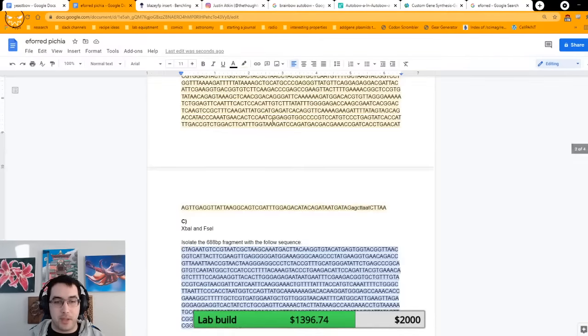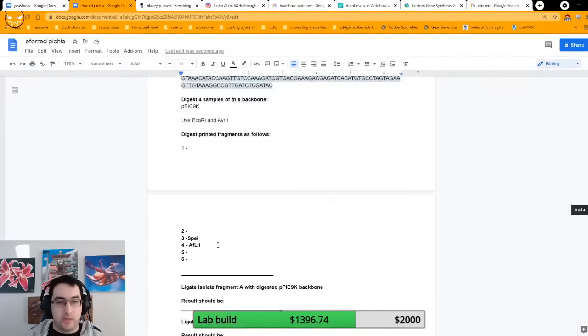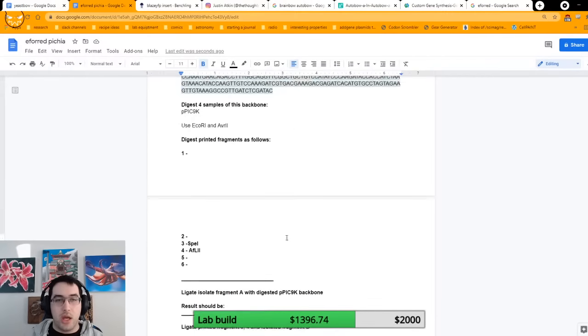Okay, that means I need to scroll down. So fragment B is my yellow. So that means I need to scroll down here. Isolate, yeah, ligate 1 and 2, isolated fragment B. No, that is not correct. This should be 3 and 4. I don't know why I pasted them in like that, but I did, and so we're living with it.